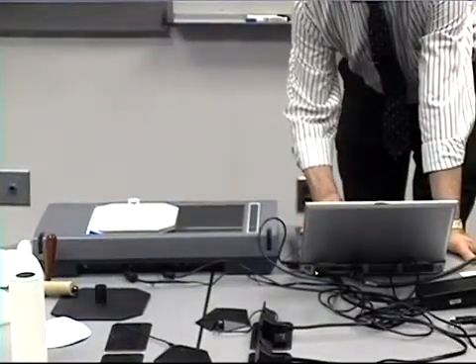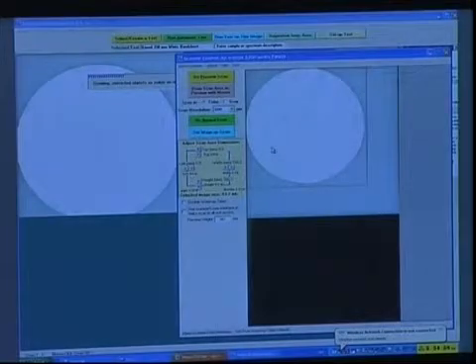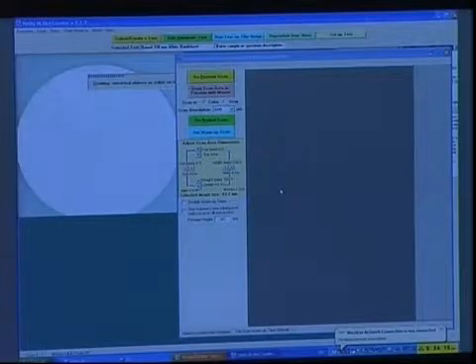Very simply, go to Set Up Test, and we will select the scanner. And with the scanner, we will make a preview scan to find out where this image is located on the scanner bed. Now, the scanner always makes a rectangular image. It will transport the image directly into the software so that we can then measure it.